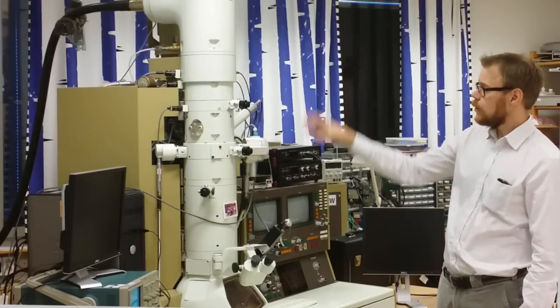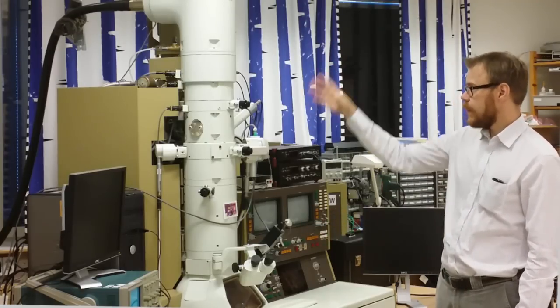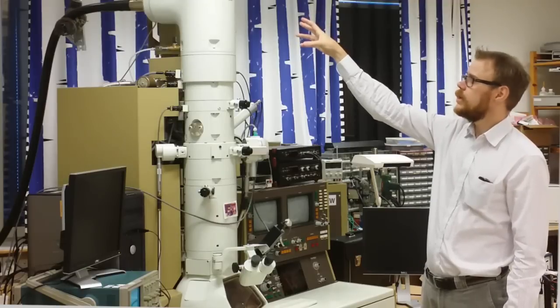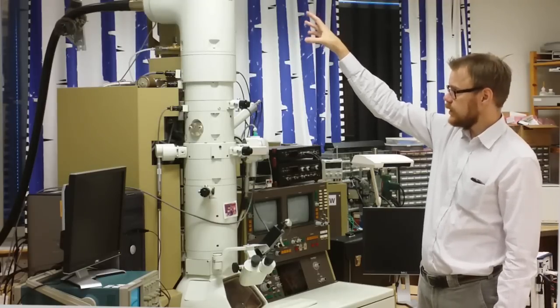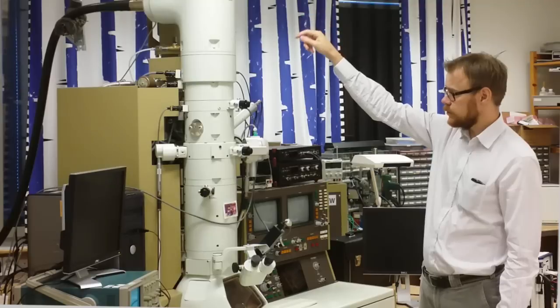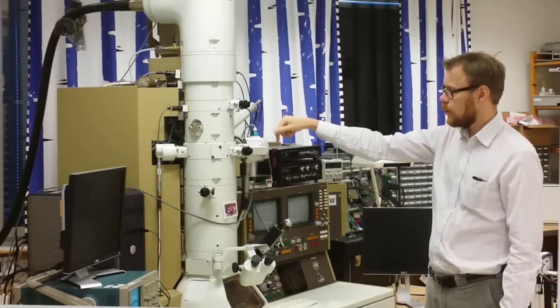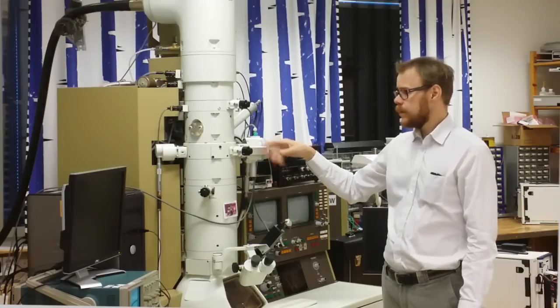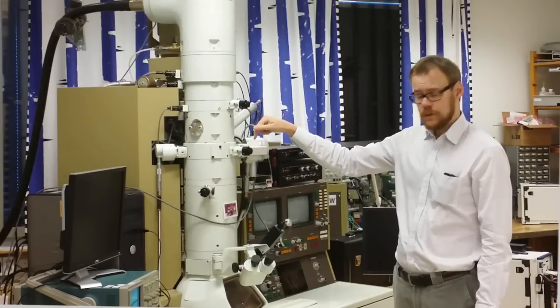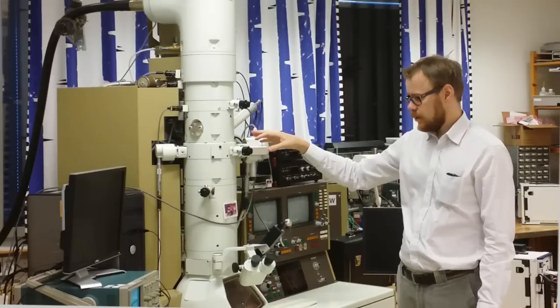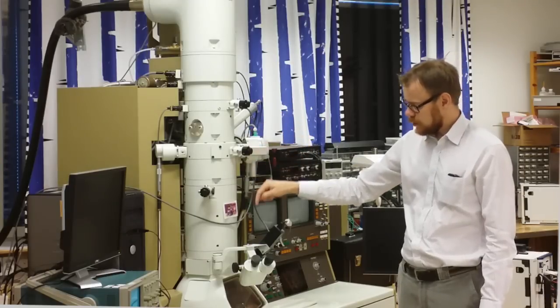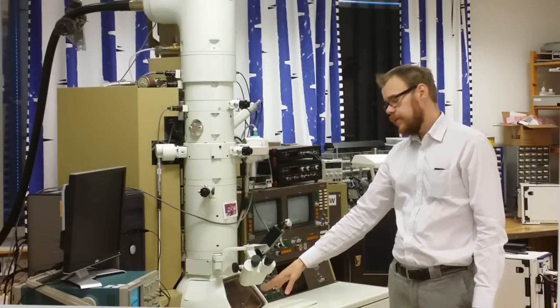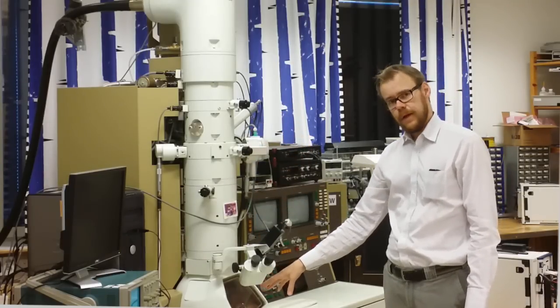This column contains vacuum and on the top here we have an electron source. This electron source shoots electrons straight through inside this column. And at the mid section here we put in our sample. The electron passes through the sample and interacts with the sample. Thereby they continue downwards the column and hit a fluorescent screen at the bottom here.